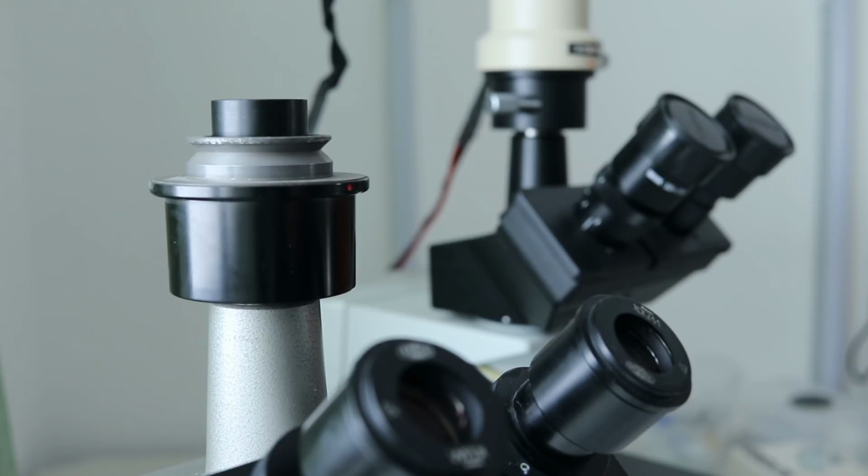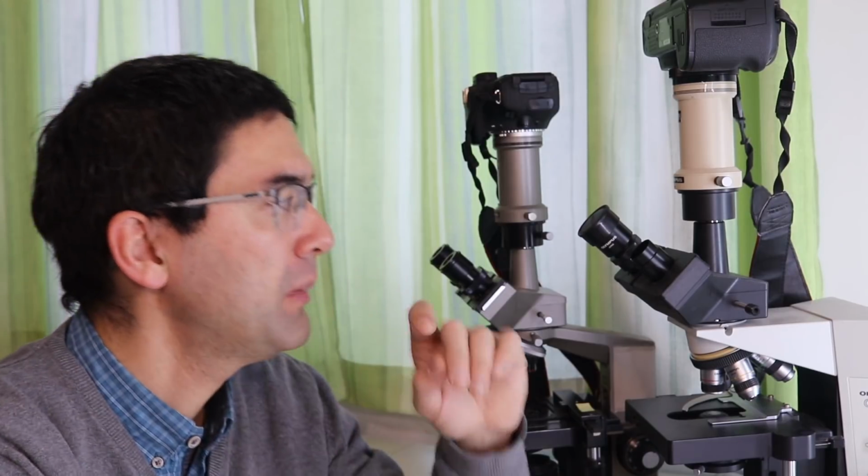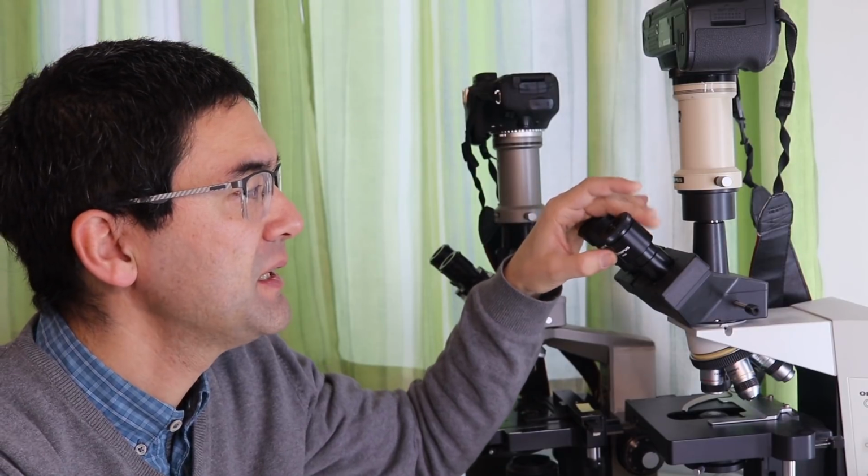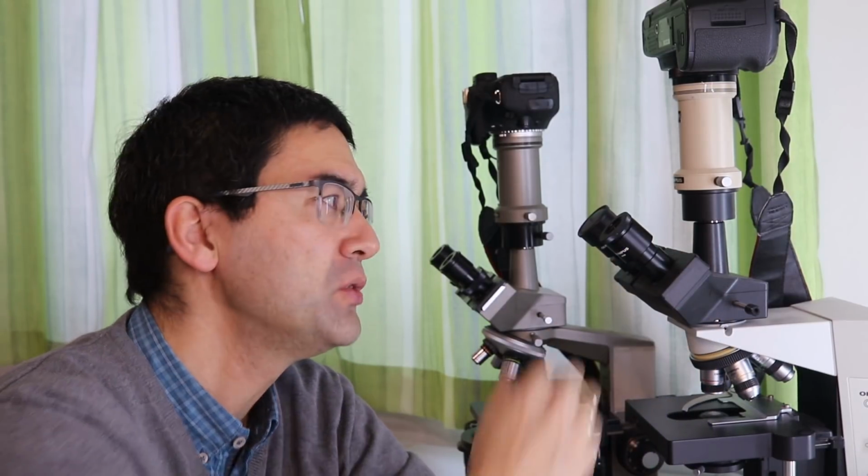So this is basically all I wanted to clarify to you today, and maybe as a last comment, if your microscope does not allow you to exchange these eyepieces, then just be aware that some microscopes have a small tiny screw here that holds it in place. So especially educational microscopes, you cannot remove the eyepiece because it's held in place with a screw. These are so-called student-proof microscopes.